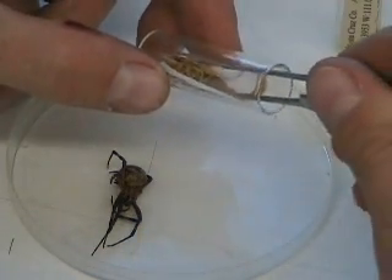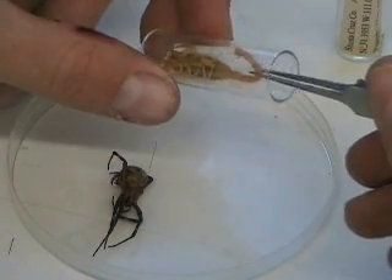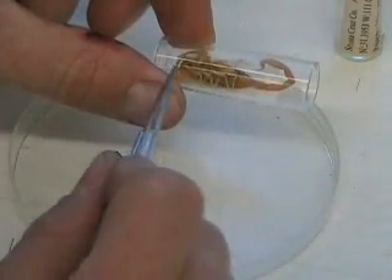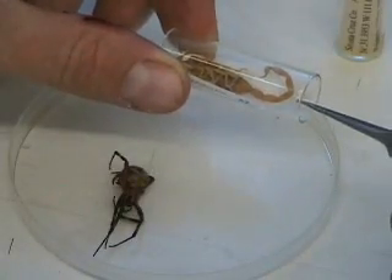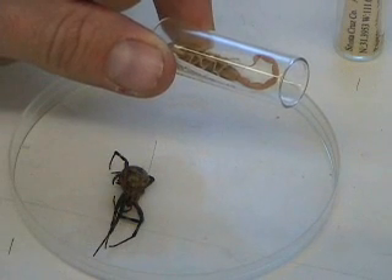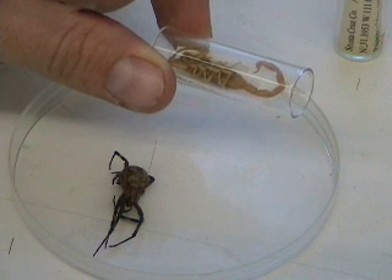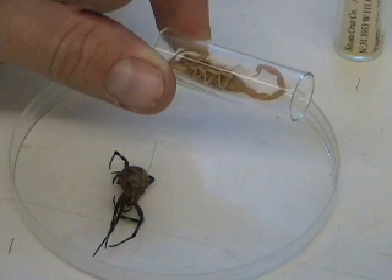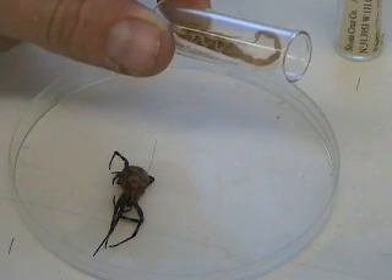If you turn it so the ventral side is exposed and not the dorsal, it's harder to identify. With this particular scorpion species, it's good to see the dorsal side, the eyes, claws, and tail. So this is a nice specimen. Then I fill with 70% ethanol. If you're doing DNA work, it's very important to use 100% or 90% ethanol to preserve the DNA of the specimen, and you should also put these vials in the freezer.